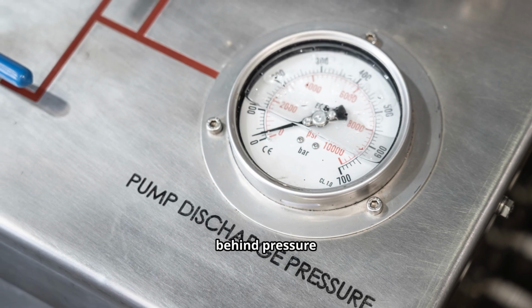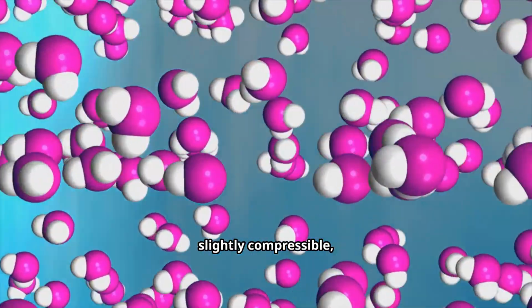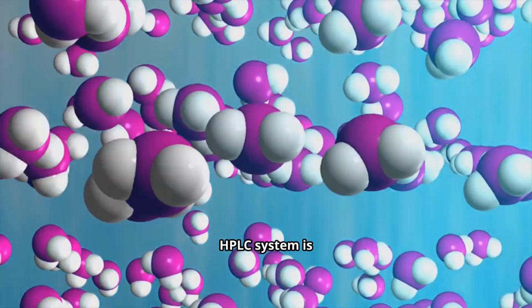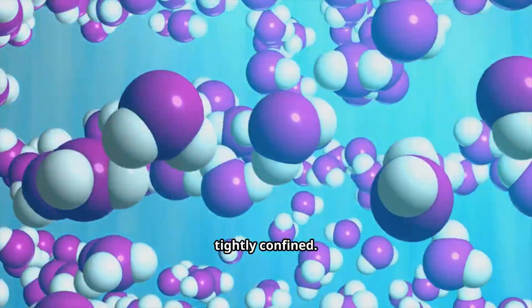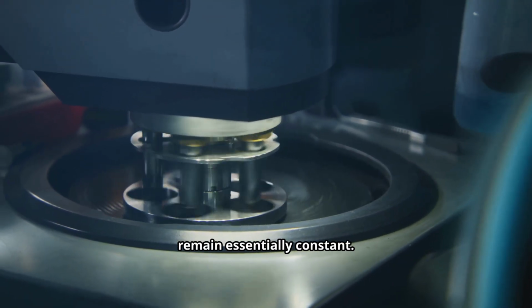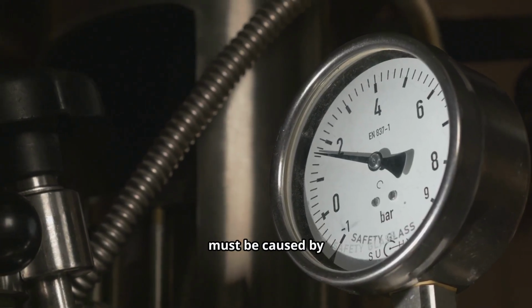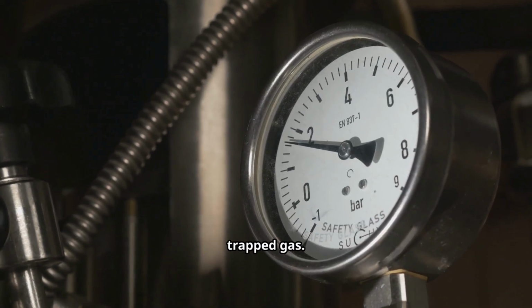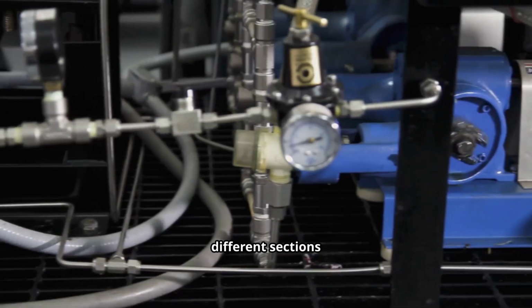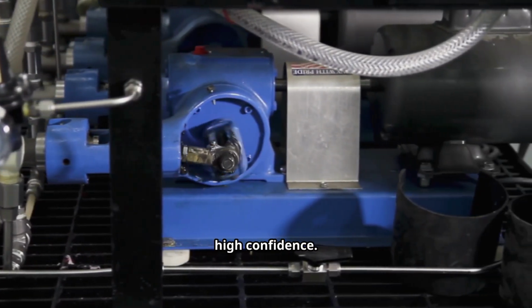The principle behind pressure isolation is straightforward. Liquids are only slightly compressible, and the hydraulic volume inside an HPLC system is tightly confined. If you pressurize the system and then stop the flow, the pressure should remain essentially constant. If it decays, that pressure loss must be caused by either a leak or trapped gas. By isolating different sections of the system and repeating the test, you can localize the problem with high confidence.